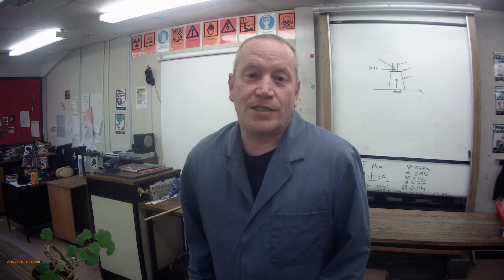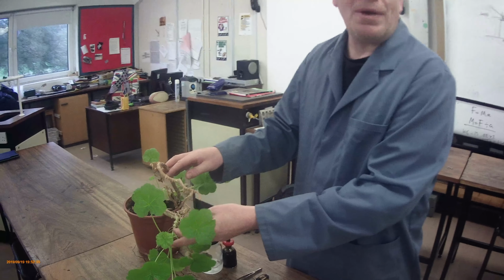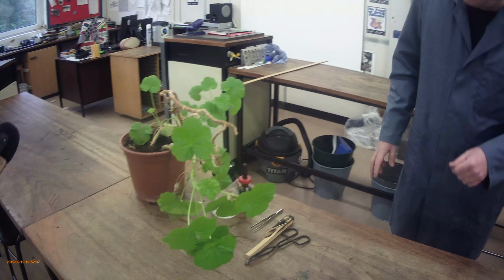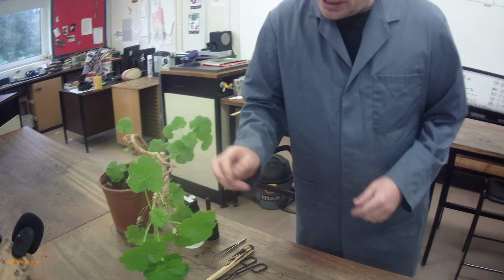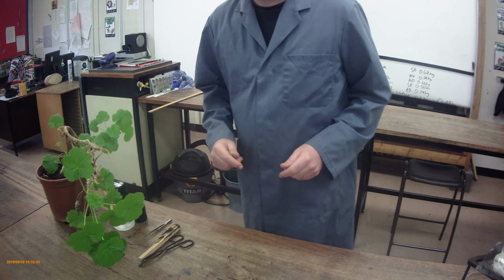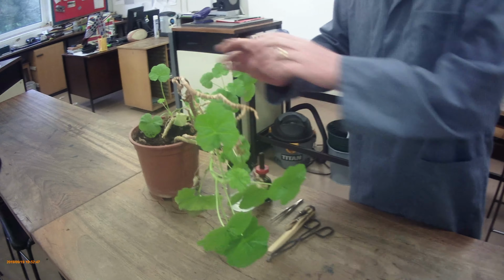Right, what we're going to do is show you how you prove that a plant has been undergoing photosynthesis and do the starch test on a leaf. Now, what I've got over here is a plant taken straight from the prep room this morning. Over the years, this plant has given up many, many leaves and is looking a little bit ropey, but we do try and look after it. It's got some nice green, bright leaves here. Looking at it, it suggests that this plant has been carrying out photosynthesis with these wonderful green leaves, some of it in a bad state.